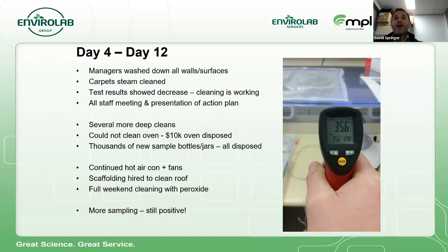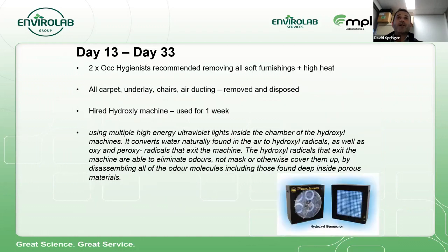So we then hired some scaffolding. We did a full weekend cleaning with peroxide. And then we did a whole lot of more air samples. And what do you know, everything was still positive. Next slide. So we're now looking at day 13 up to day 33.